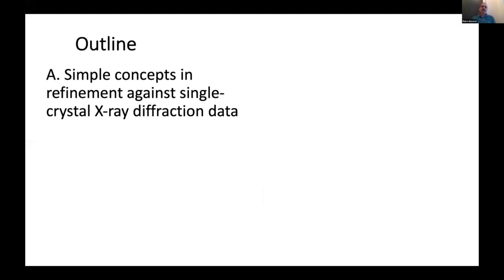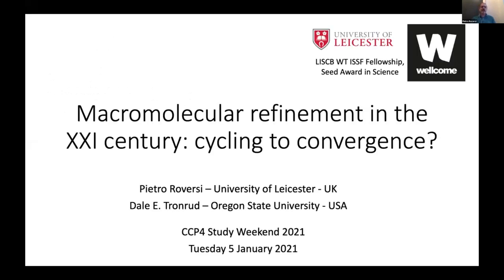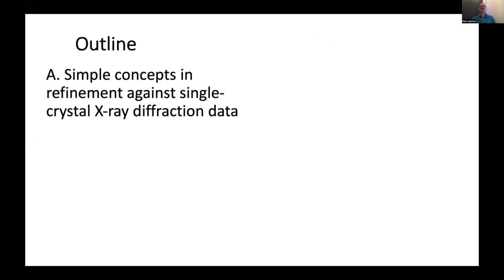The outline of the talk indeed starts with, or rather, it's mostly about refinement in the context of single crystal X-ray diffraction data. I'm hoping that the more experienced colleagues and friends will not mind, and that at the very least this serves as a list of references for the junior people in the audience. I have asked Dale Tronrud to help me with this, and he's been wonderful. I have not really been developing software for more than 15 years, so you can imagine that I'm skating a little bit on thin ice.